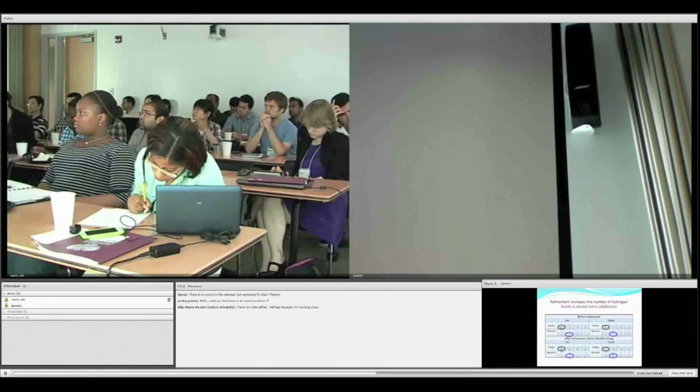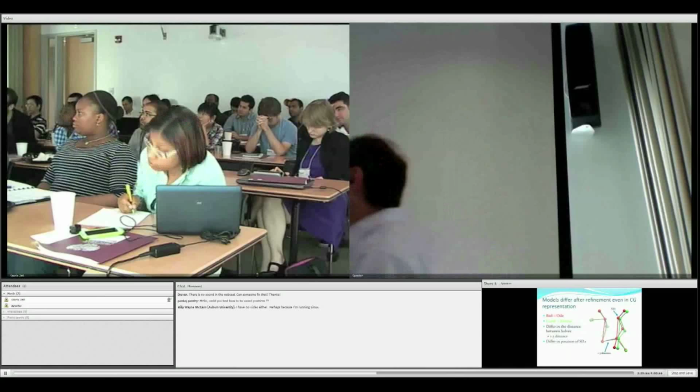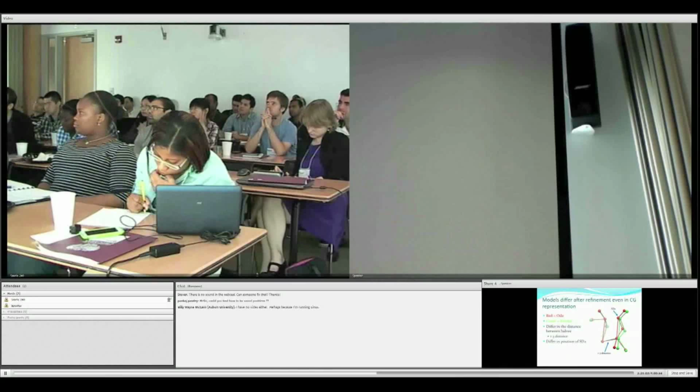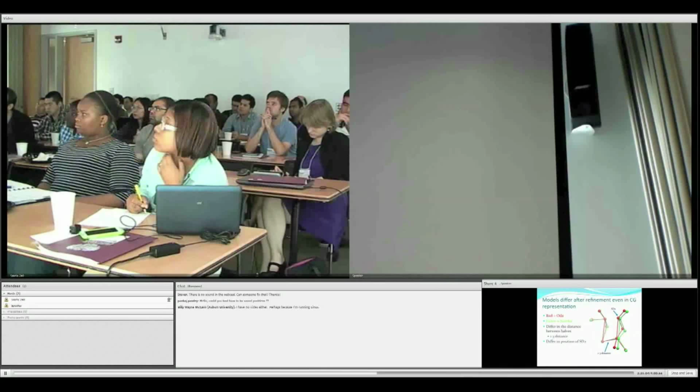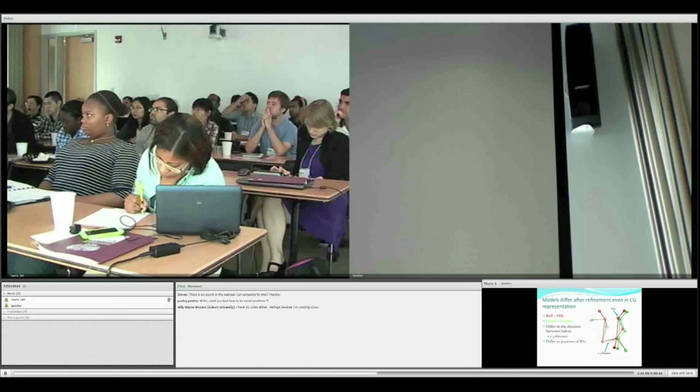But the important thing that happened during this process is that refinement can improve interactions between and within subdomains of actin. Actin is divided into four subdomains colored in pink, cyan, ochre, and lime. If I look at the hydrogen bonding network for these four domains, this is before and this is after the refinement.